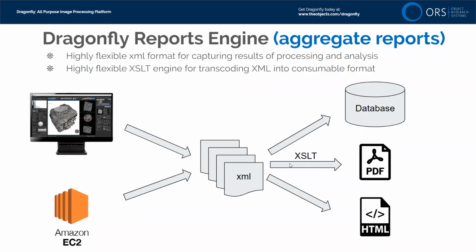So I had a user who says, well, what if I want to know the trabecular thickness spread? If I compute trabecular thickness on bone 1, bone 2, bone 3, bone 500, that's great if it's in one report, but what if I want to see a histogram or a distribution? Then you would need to interrogate a collection of reports. So this is something that users could do in the future, is program or write their own style sheet transforms or other codes to transcode a stack of XML reports into an end report. All right, I think that's all of the slides that we'll go through for today.